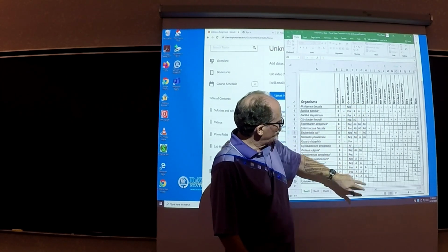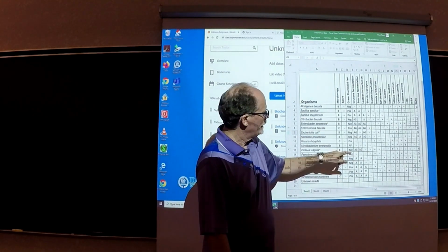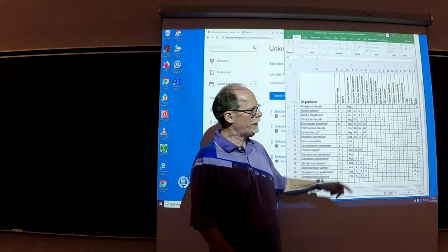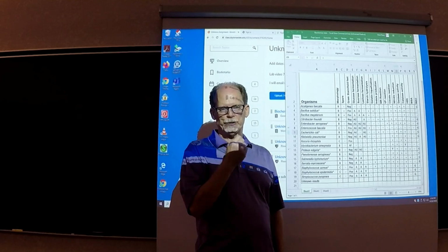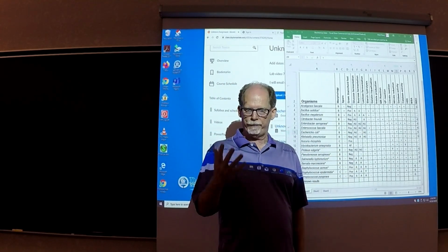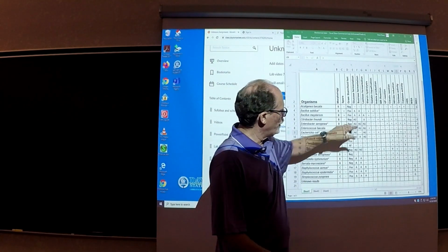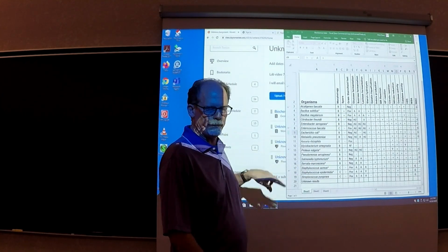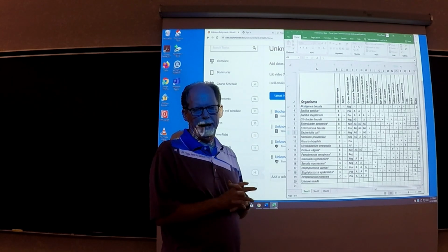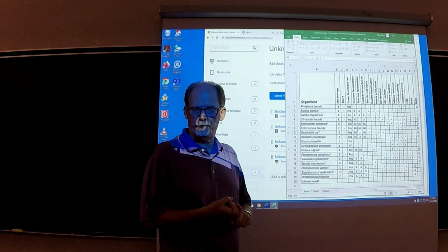The lactose I'll use. A means acid, it made an acid, and it fermented lactose. If it didn't ferment lactose, you'd see a negative sign. The G means there's a bubble in the Durham tube. So it fermented, and you got a bubble. The starch hydrolysis on the starch plate is positive or negative. If there's a halo, it's positive. If there isn't, it's negative. On that PowerPoint, you'll see a starch plate, and I think it says your unknown is organism A. So you look at the results that A gave and determine if it's positive or negative.